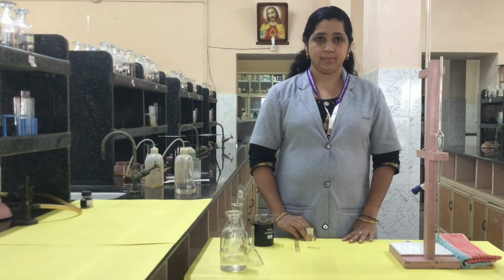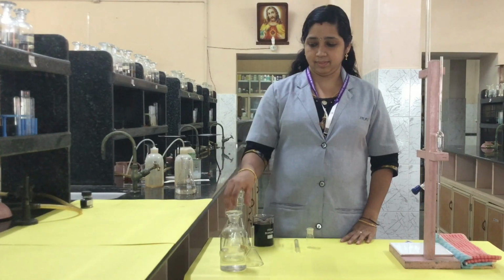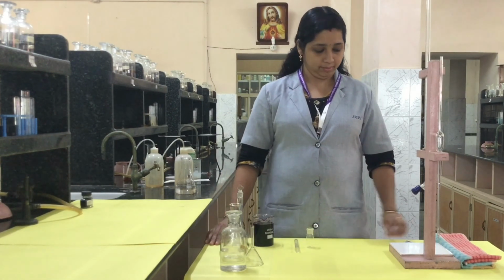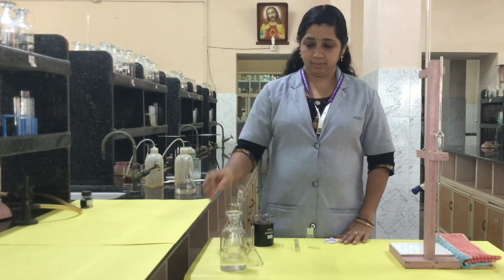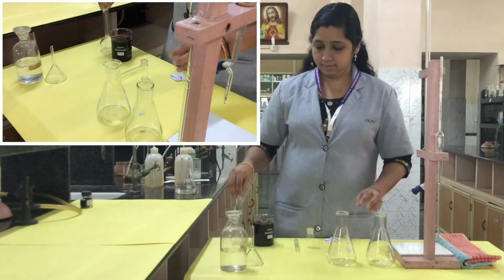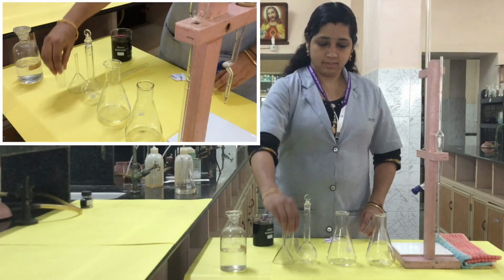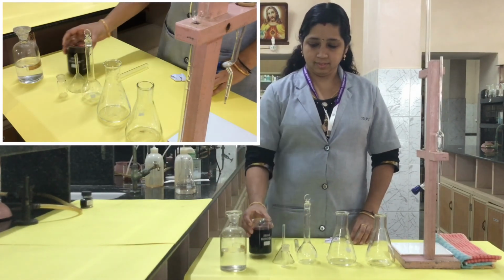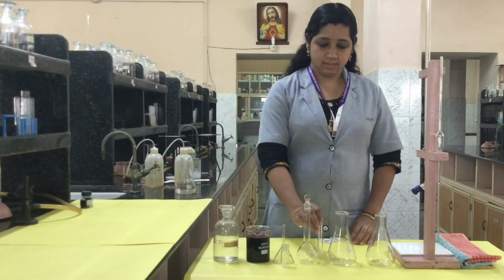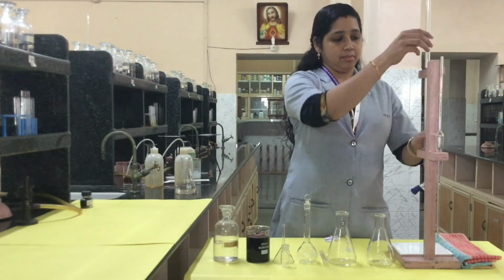Good morning, children. Today we will discuss the experiment volumetric analysis, that is the estimation of KMnO4 using Mohr salt. The materials required: two conical flasks, standard flask, funnel, weighing bottle, then KMnO4 solution, sulfuric acid, then pipette and burette, then titration stand.